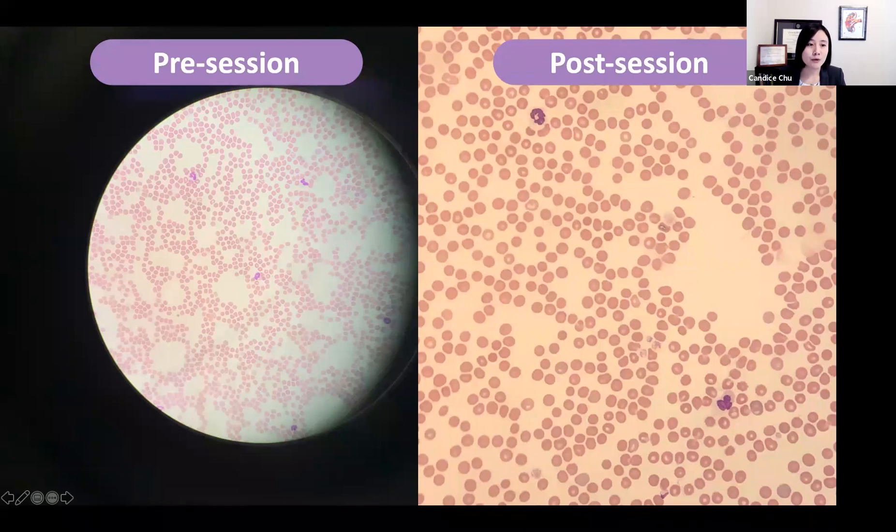So this is the striking comparison between the pre and post. Before they've taken this course, they don't know that they can zoom in first. And obviously there is some blur at the periphery of the picture, but the post-session picture is very good.